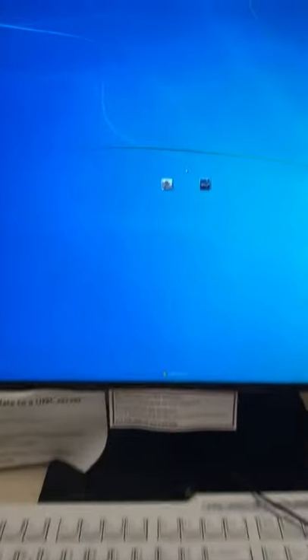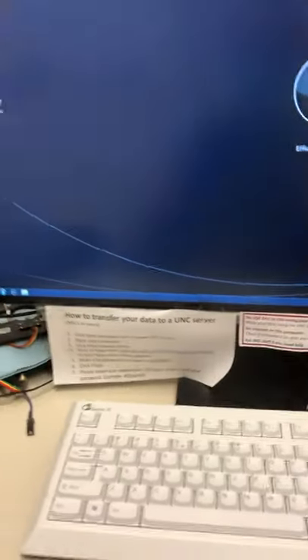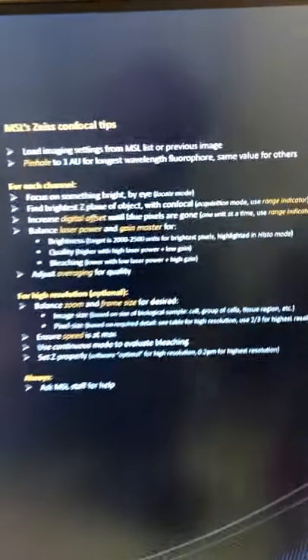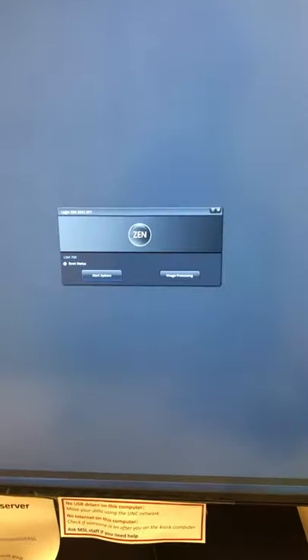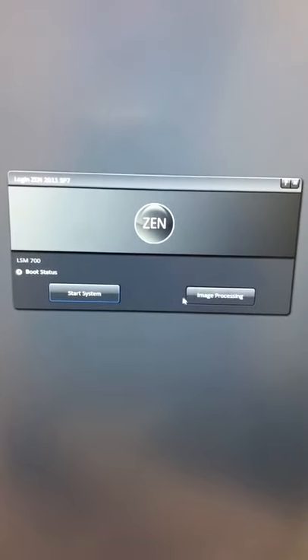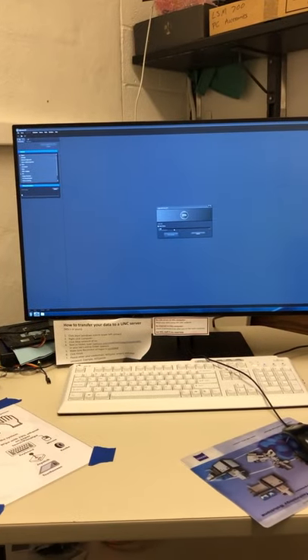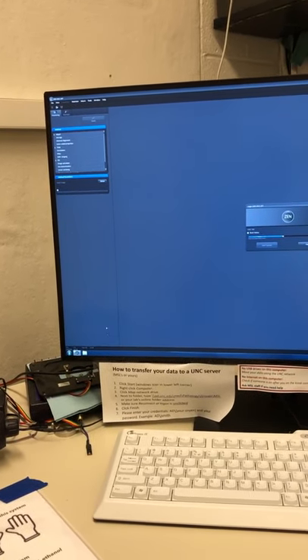Now we have to start Zen. We haven't logged in yet, so I'm going to do that by clicking LSM user — there's no password. Then we start Zen by double-clicking here. Note that confocal tips are on the desktop for reference on basic imaging. When Zen starts, we see a dialog box with the option to start the system or do image processing. We're going to select 'start the system,' and if there are any errors during startup they will show up in a white box with messages.